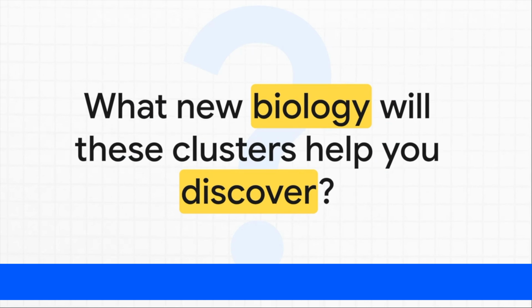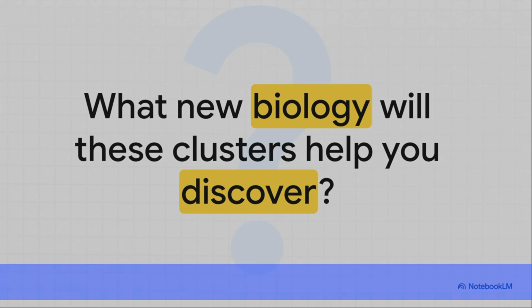But here's the thing to always remember. This isn't the end of the analysis, not even close. It's the beginning of the discovery. These clusters that the algorithm found are now the foundation for your next big question. Which cluster expresses the gene you care about? How do these populations change between healthy and diseased states? The map is drawn, and now it is your turn to explore. So what are you going to find?